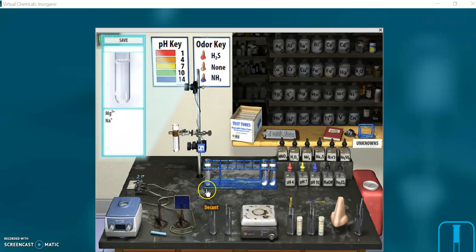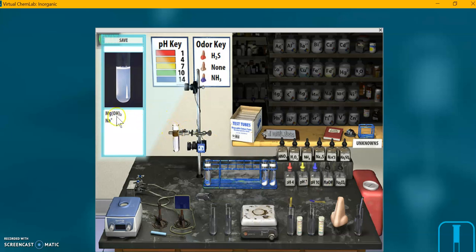Last, I'm going to test for the magnesium ion. So what I'm going to try here is this, I'm going to grab some sodium hydroxide, click on it, and check it out. Immediately, it's in there. It's dispensed in there.